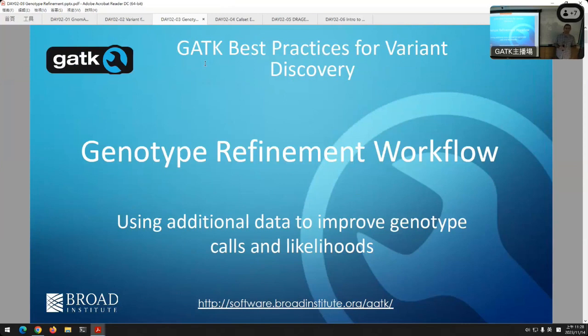Actually, there is a sense where it could make sense biologically, which is tricky. And that is when you got the genotype wrong in the parents. For example, let's say the mother was not actually homozygous reference, but had a large deletion. So actually she was heterozygous, reference and a deletion. What she passed on was the deletion to the child, and then the child could have gotten the SNP from the father. Now the child has a deletion and the SNP, and it looks homozygous. So that's a rare case.